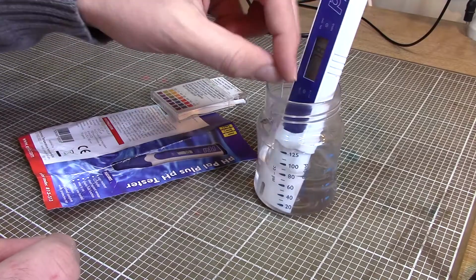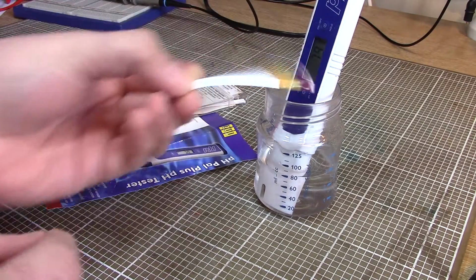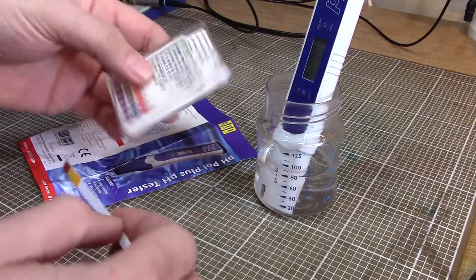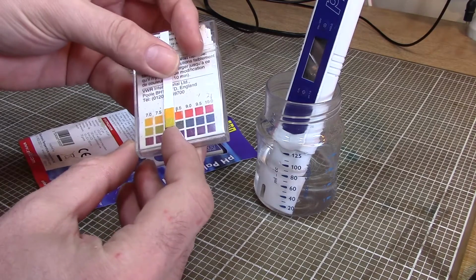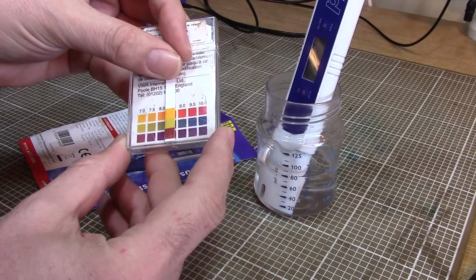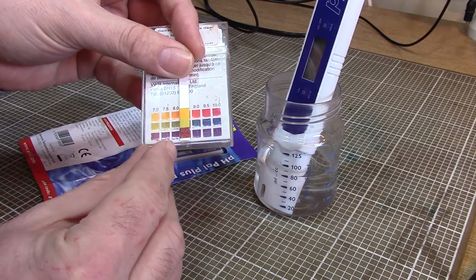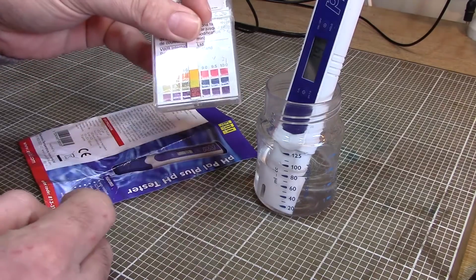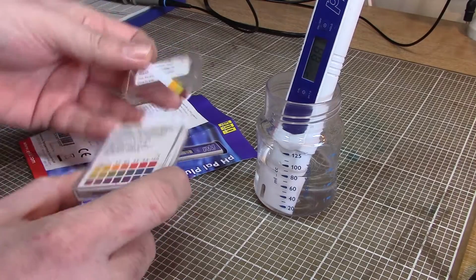If you're ever in doubt of your pH meter's calibration, it's very, very quick and easy to dip a strip of paper in and see where we weigh up on the scale of things. And I think we're 7.8, and we're certainly looking somewhere around 7.5, 8.0 on the readings there. 7.9 now our pH probe says. So how does this all work then?